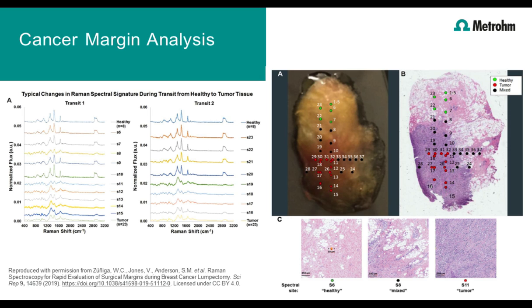In the microscopy image on the left, we can see that there are different axes labeled, and the one labeled 6 all the way down the center to 15 corresponds with the set of Raman spectra on the left. So that also starts from spot 6 all the way down to spot 15.